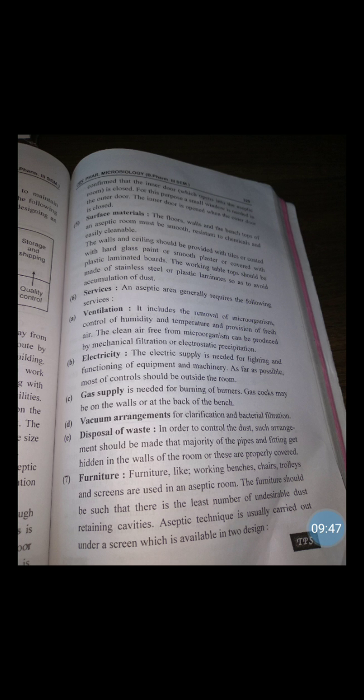Gas cock may be on the walls or at the back of the bench. Then vacuum arrangement. It is needed for clarification and bacterial filtration.